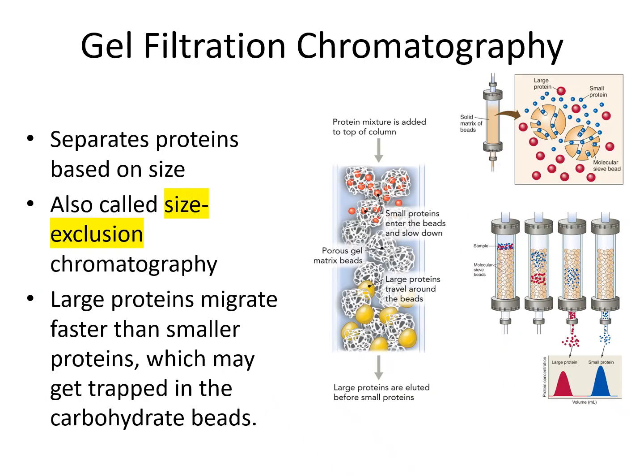And on the upper right corner here, you can see the resin: the smaller molecule is trapped in the resin, and the large molecule is excluded. Therefore, the red one will go through the resin faster and be eluted first, and then the blue one is trapped inside the resin, so it comes out later. So that's size exclusion. Okay. Now we are going to watch the video about size exclusion chromatography.